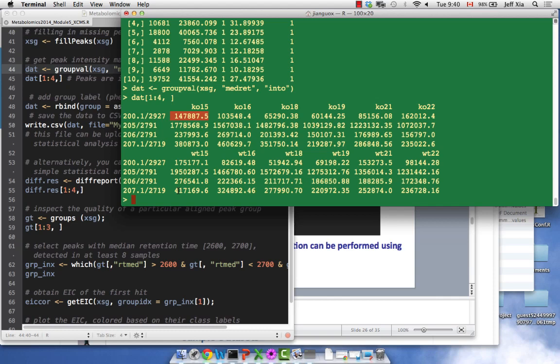When you go to group values, there are several options already built in. You just pick one, and there's also maximal peak intensity. You can see some of the values are very different. For me, original is more comfortable, unless you have a strong reason to use the other values. You can see this group values help file, and see what other options and what other people think about it.